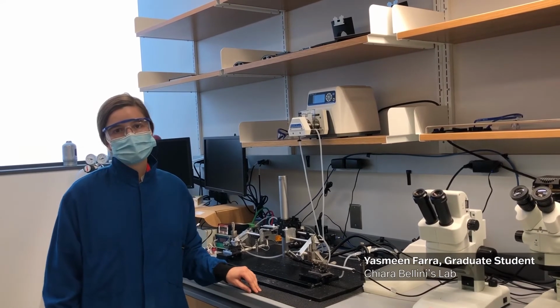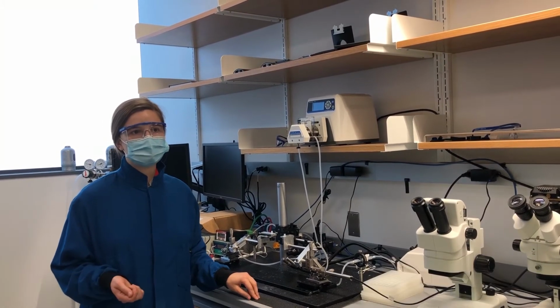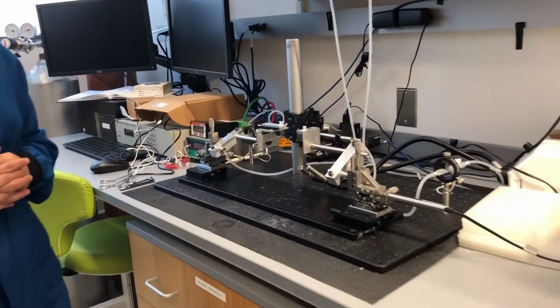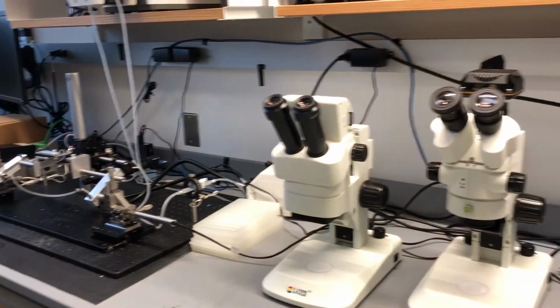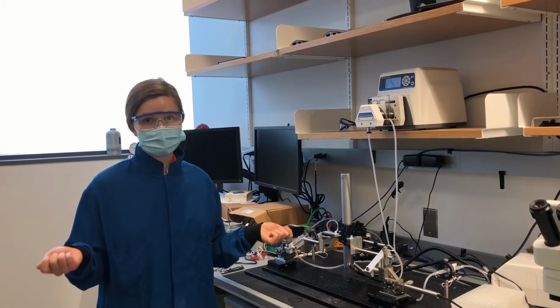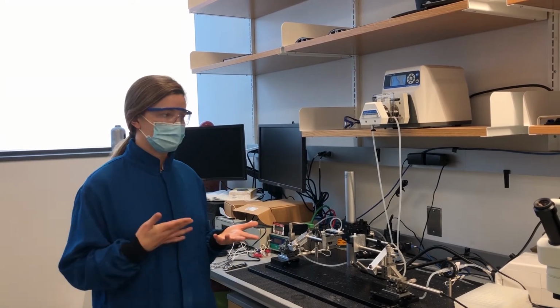So in the Bellini lab, we are interested in the effects of different disease conditions on the cardiovascular system, specifically the arteries and the aorta. And so with this device here, what we do is we perform biaxial mechanical tests on specimens of artery tissues. And so using this device, we can apply forces both in order to stretch the vessel and pressurize it from the inside to simulate sort of blood pressure when the heart is pumping blood through the arteries.